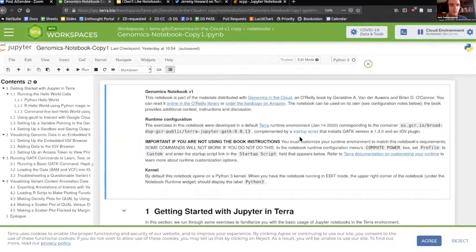And that points a little bit to the reason for the notebook existing in the first place and being useful in this context, because we've all typed in the commands in our VM and we were able to run things like that. And then we copied files into buckets and visualized them.